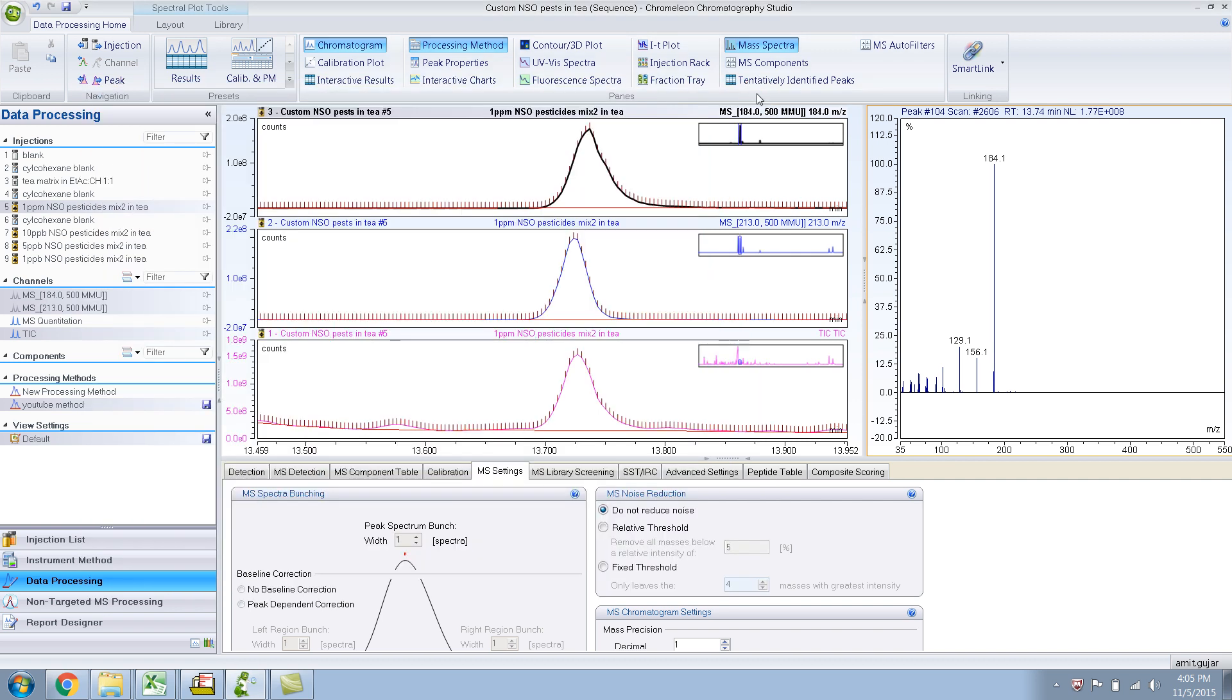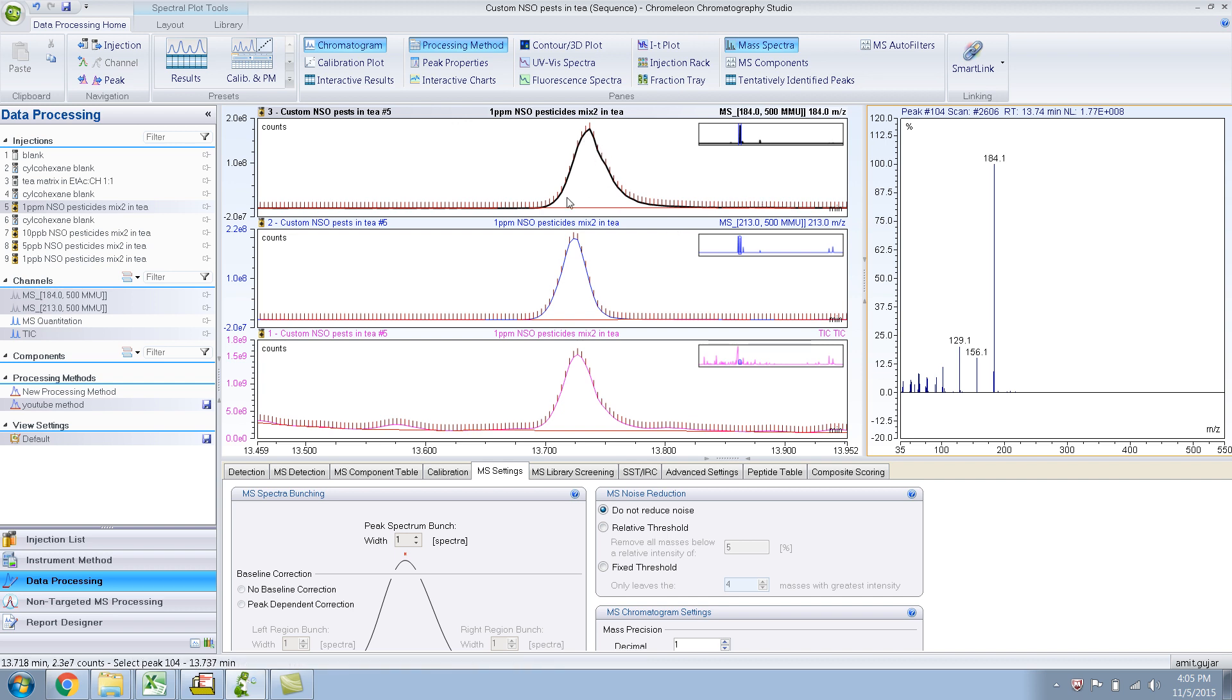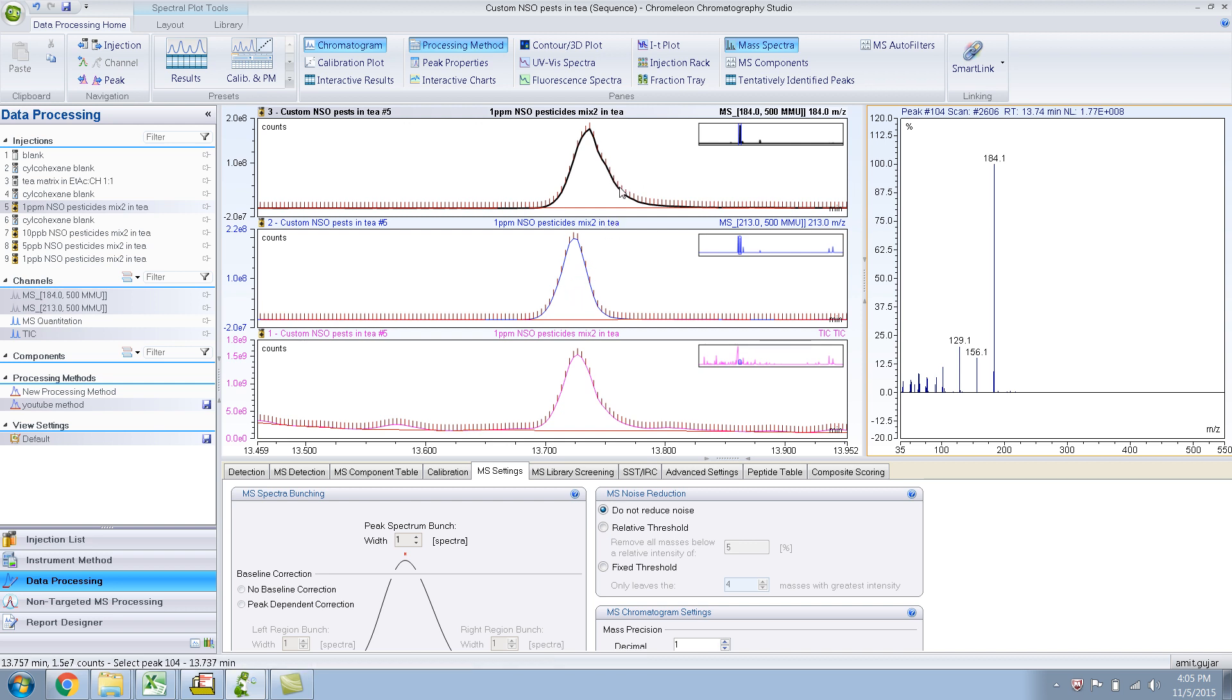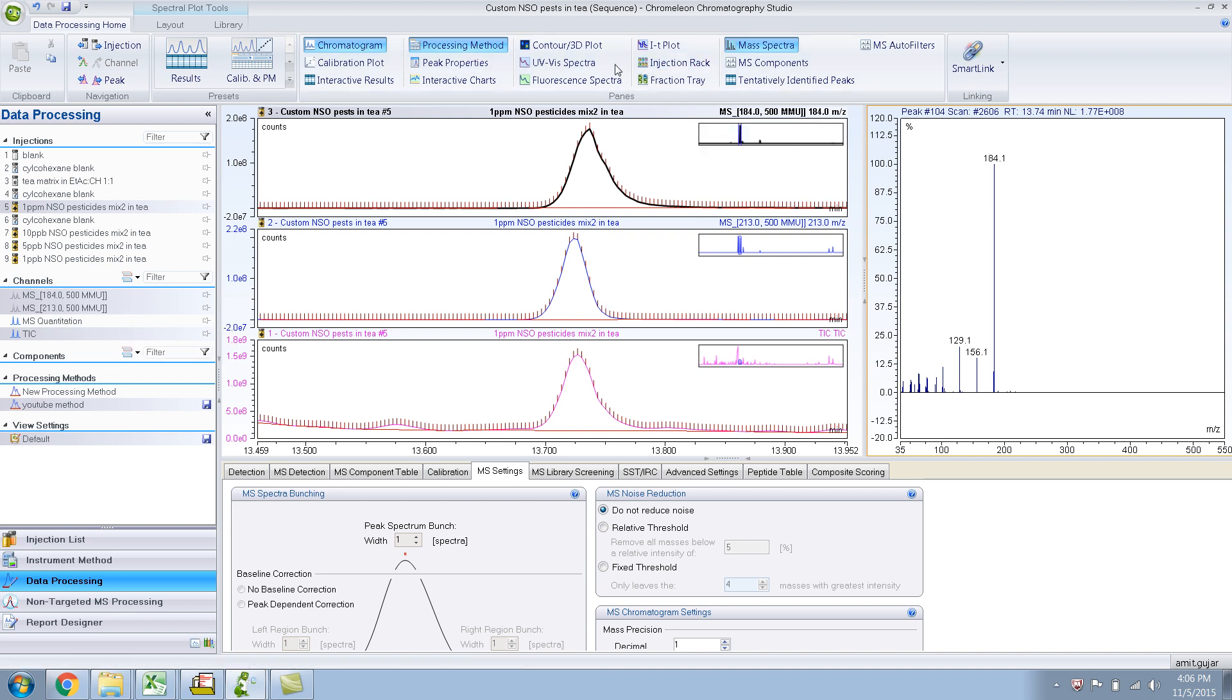So there you have it. So I have shown you how to do a sort of manual subtraction of different mass spectra, because in this case, if you remember, we were getting coeluting peaks. These peaks are so near each other that they show up as just one peak in the TIC.